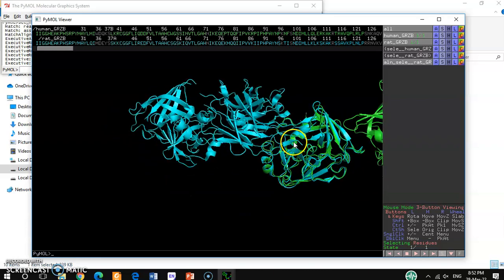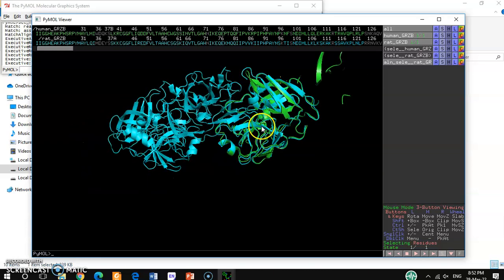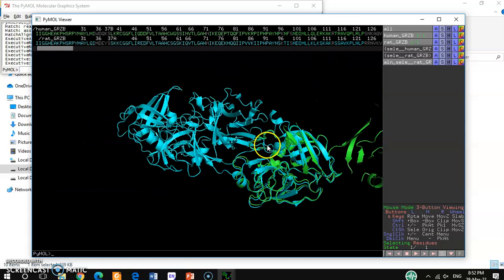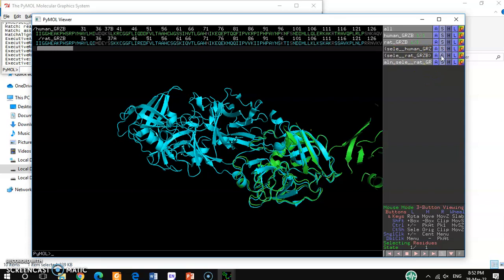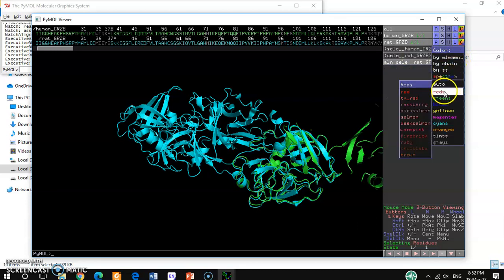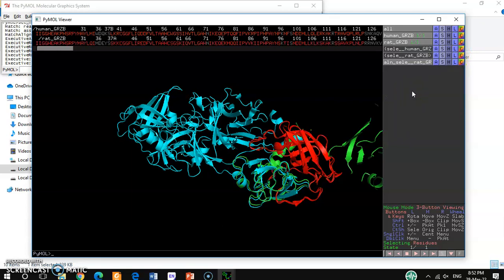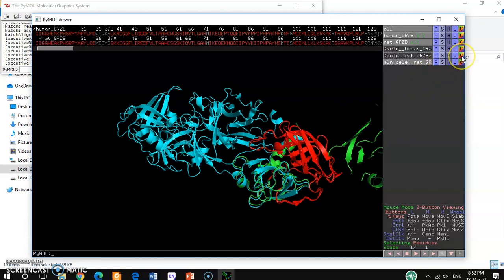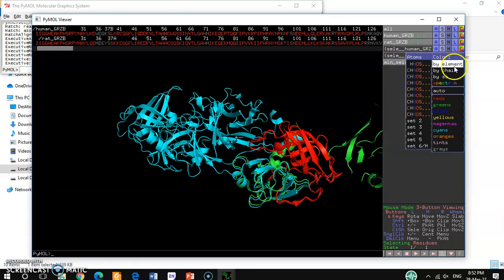To visualize the alignment more conveniently, you can also change the color of the selections. I want to change the color — for this selection I'll change it to red, and for the other one I'll change it to yellow.